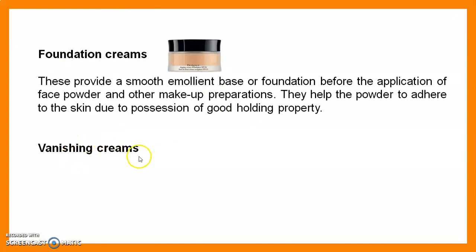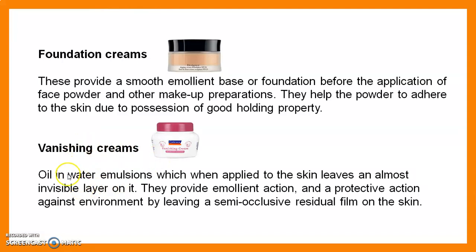Then vanishing cream, an oil in water emulsion which when applied to the skin leaves an almost invisible layer on it. They provide the emollient action and a protective action against the environment by leaving a semi-occlusive residual film on the skin. Its effect is that it evaporates after its use. That's why it is called vanishing. The cream can vanish or it leaves only a film on the skin.